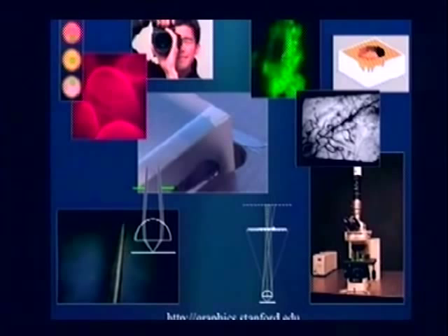Why do microscopes only have orthonormal projections if scientists are interested in perspective? So I think the telecentric nature of it, the fact that it doesn't change size when you focus it, is more important. The fact that you can move it to any point in the field of view and see the same thing is more important. That also means that you can move things over and continue to take pictures and actually seam together a mosaic. There may be other reasons having to do with minimization of aberrations that I'm not saying or am not familiar with.